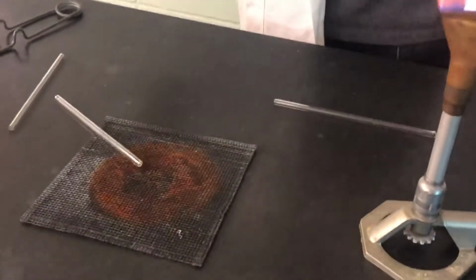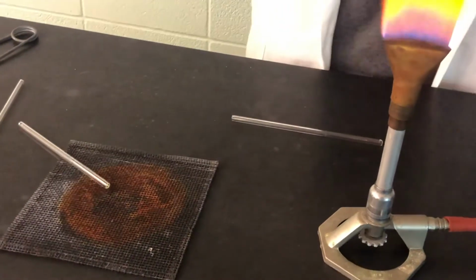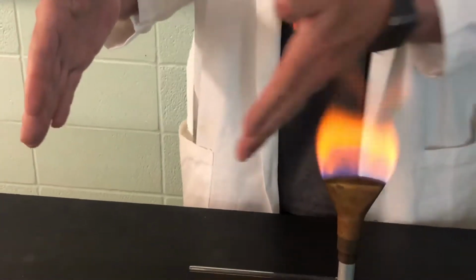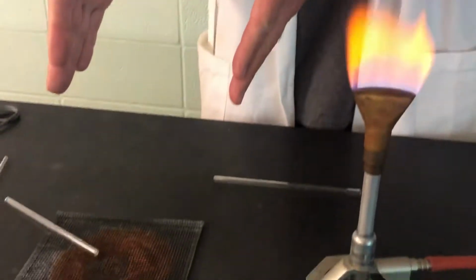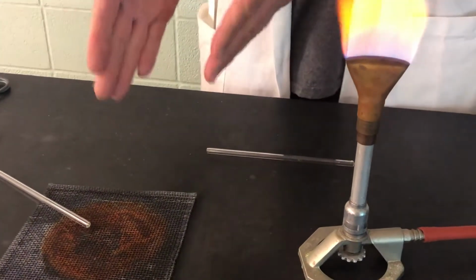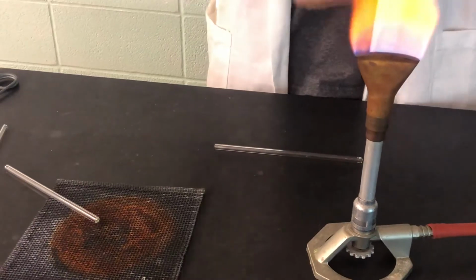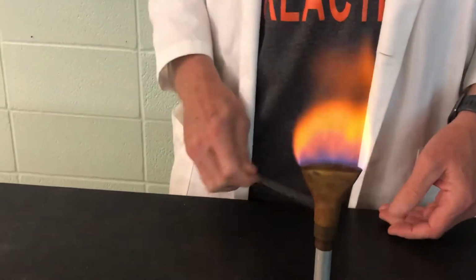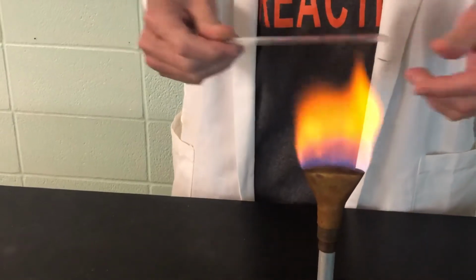And then I'll lay it on the wire gauze again. That's just to remind me and any other student, one of the things that I coach you as students to do is to keep a wire gauze handy so that others know that at some point this was really hot, to avoid accidental burns. Because glass, as you can see, when it's hot, you can't tell.